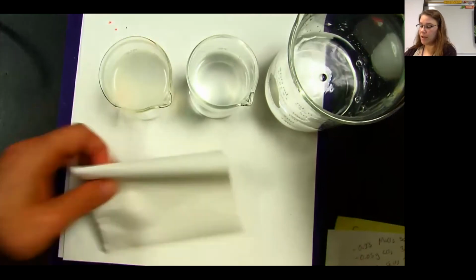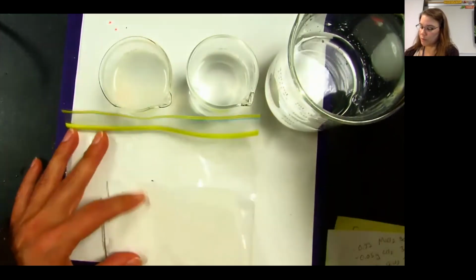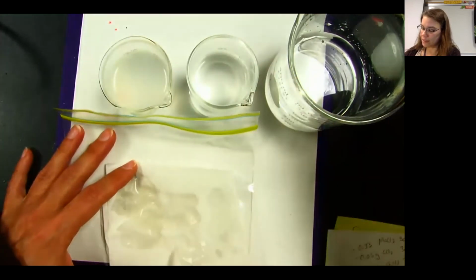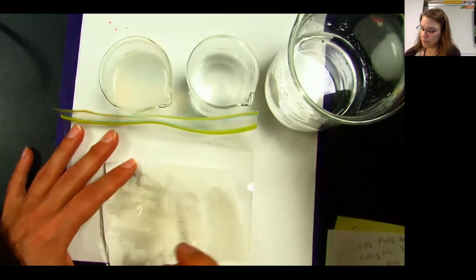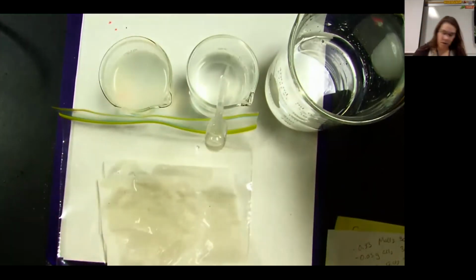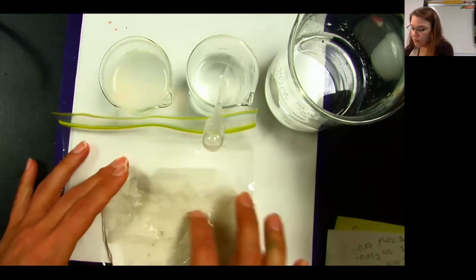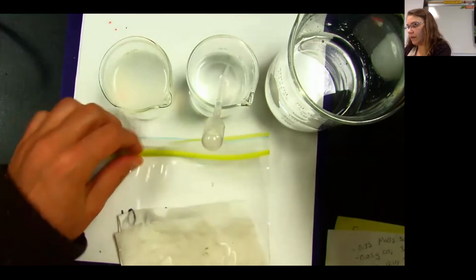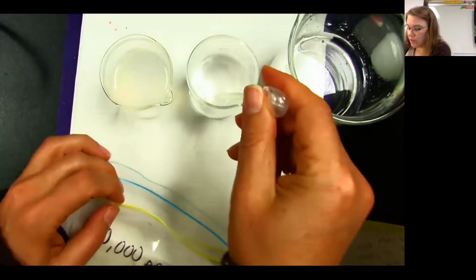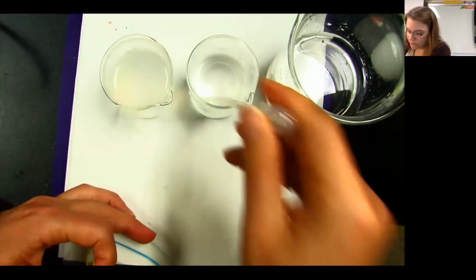It'd be a good idea to clean my pipette before I put a new solution on. Here's my 10,000 part per million solution. Again, I'm going to get it a little wet so that the seeds stick. And then I'm going to put the seeds on it and put it into the baggie. And add just a little bit more, making sure that it's plenty wet.